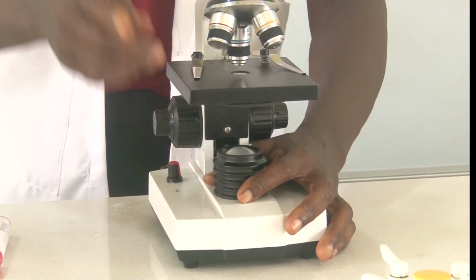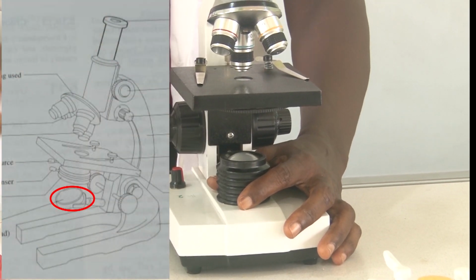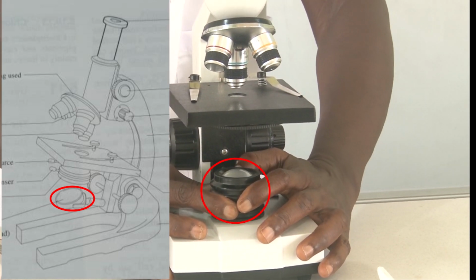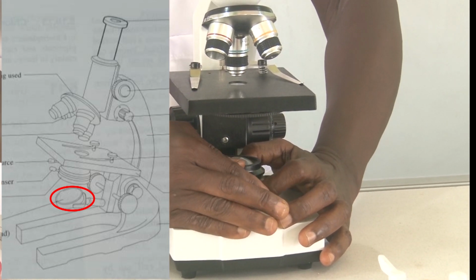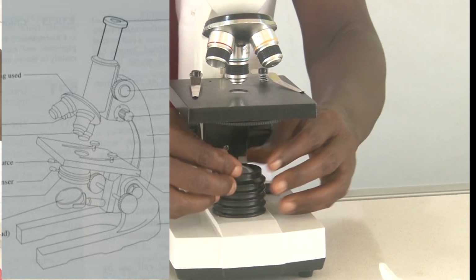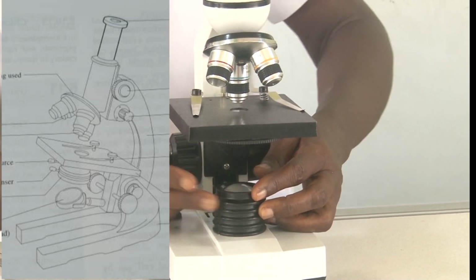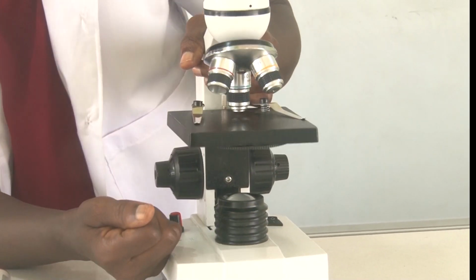The simple microscopes you see in the shots have a mirror there. This one has a light inbuilt. The mirror will trap light if it's a mechanical one. This is connected, there's a bulb in it, so there's light that will come in.